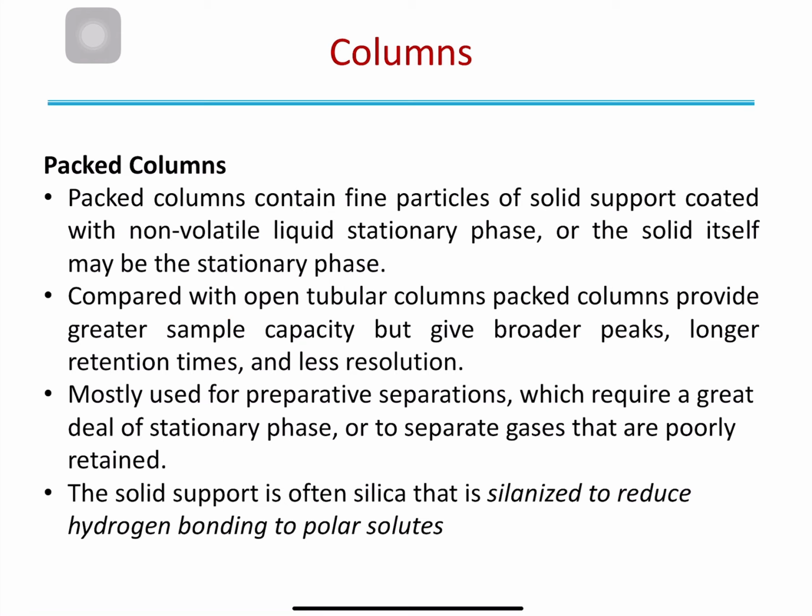But they have the disadvantage of giving broader peaks, longer retention time, and less resolution. So when you think about it, why would we use the packed column? It gives us several advantages. One of these advantages is that we can use it with larger quantities, so we can use it for preparative separation. Preparative separation means that you separate your components and you want them separated. It's not just for qualitative and quantitative analysis, but also for preparation.